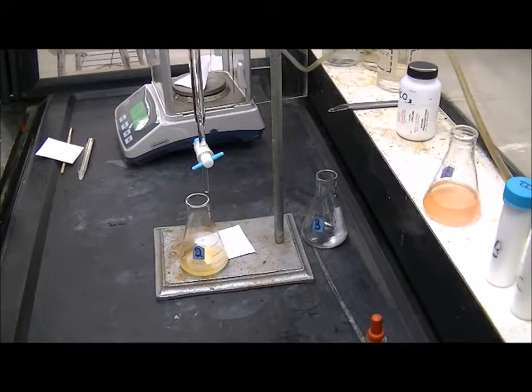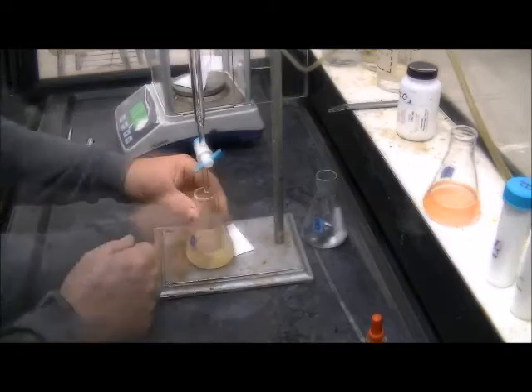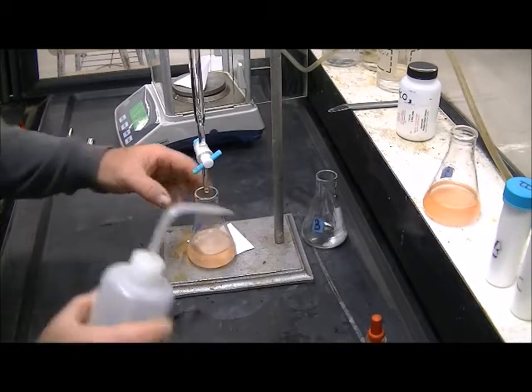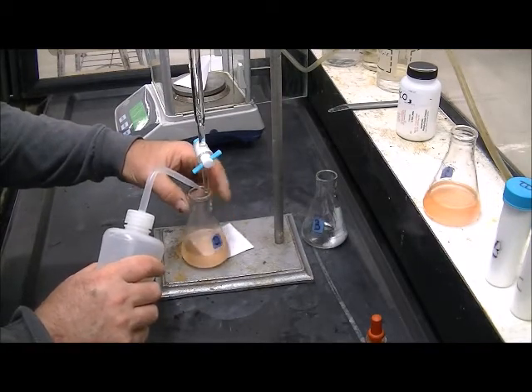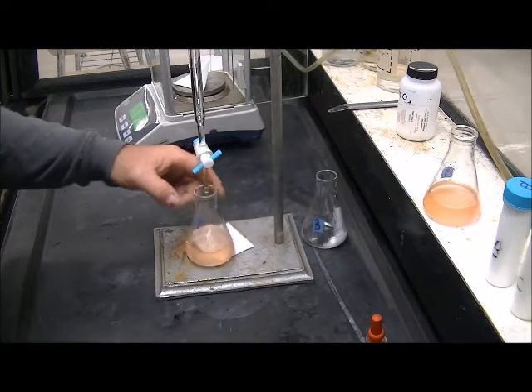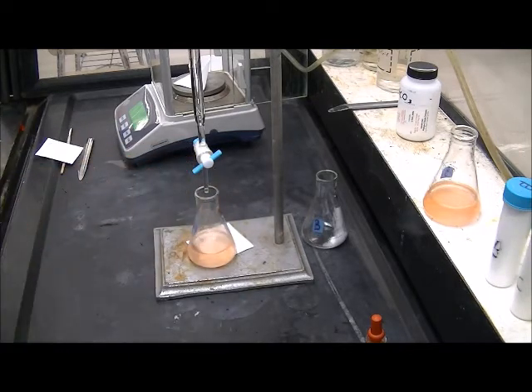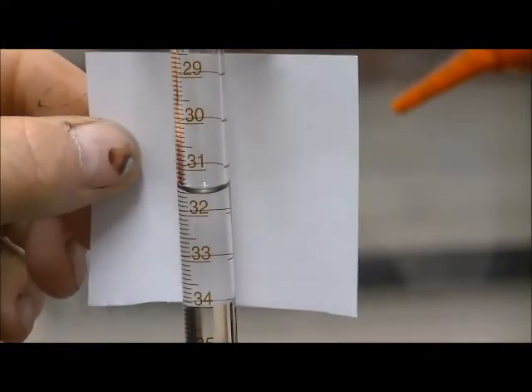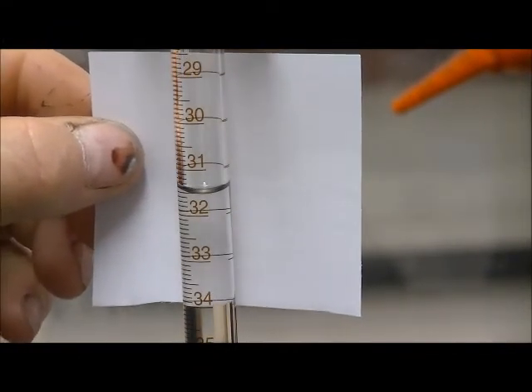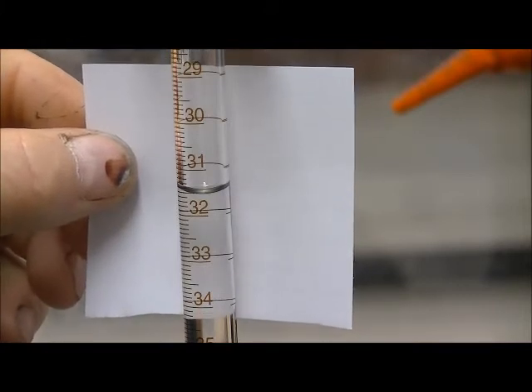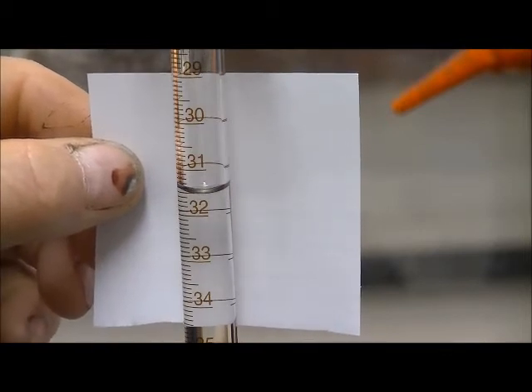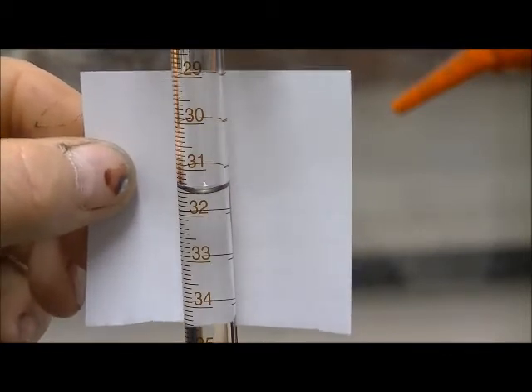This is sample two for unknown A. That might be it right there. It looks good. Everything washed off the sides to make sure. Let's call that the end point right there. And that looks like 31.55 we're going to call that. It's just below the half way mark. So 31.55 milliliters.